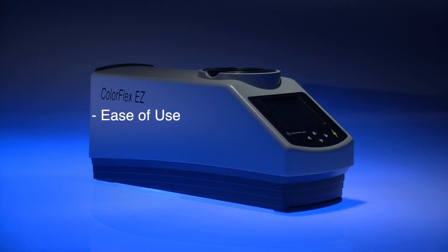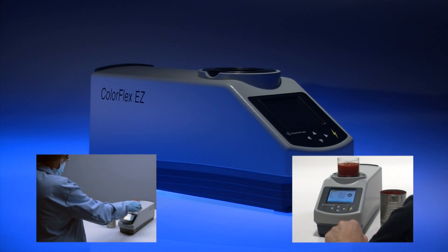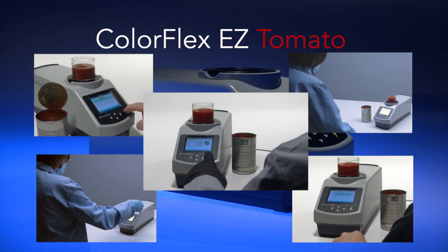Ease of use, rugged construction, and specifically designed for use in the tomato processing industry — that is why every minute of every day, somebody somewhere in the world is using a ColorFlex EZ Tomato.